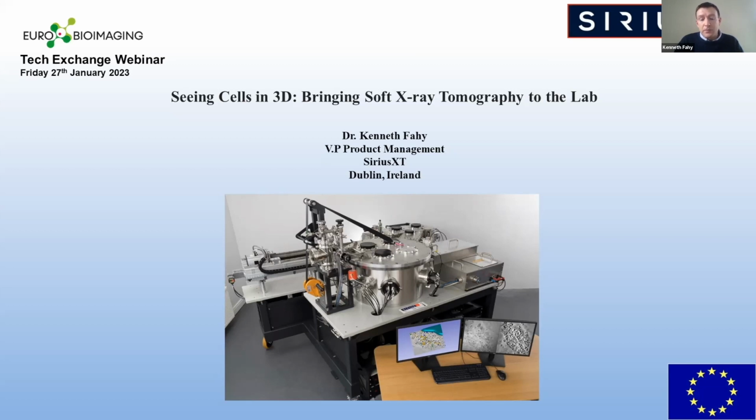In this talk, I'll give you a brief overview of the technique of soft X-ray tomography itself. I'll introduce our lab-scale microscope, which we call the SXT100. And I'll give you a flavor of some of the scientific use case projects we are currently working on.